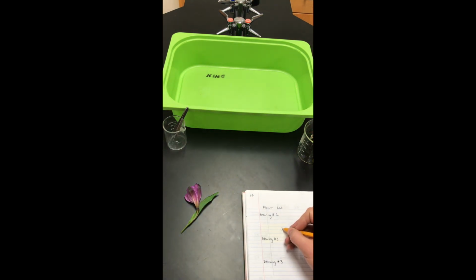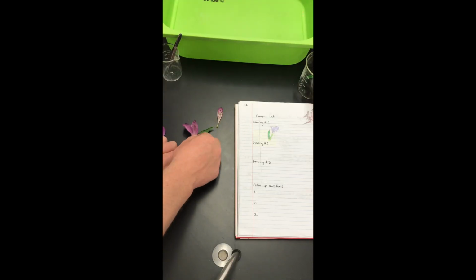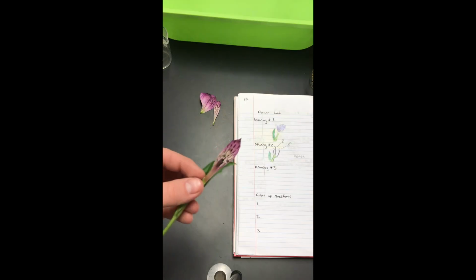Now, the first drawing is just going to have you interact with the outside of the flower. So without removing any petals, make sure that you examine the outside, record some observations, and use some bright and nice colors on your drawings. Right? So next, the step 2, drawing 2, will have you remove half of the petals. So now this will expose the carpel and the stamen. Right? So the male and female parts of our flower.